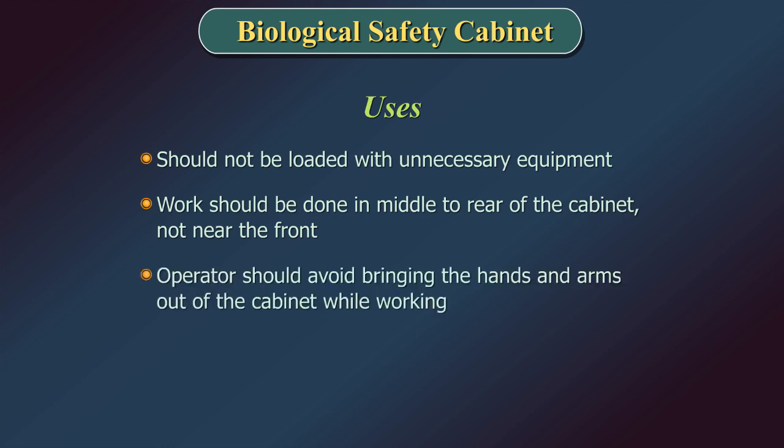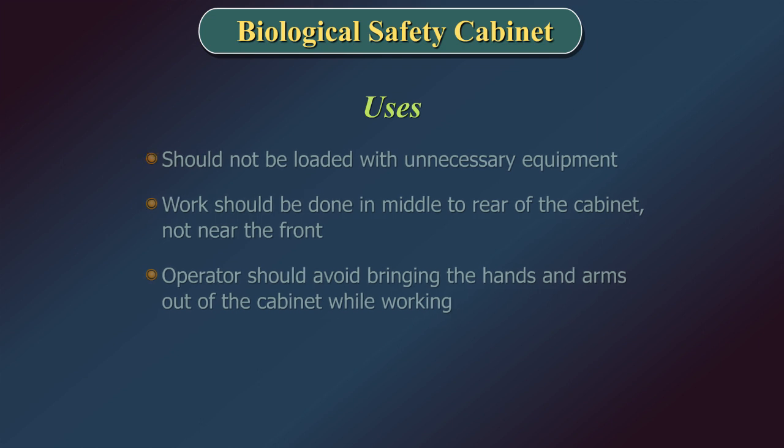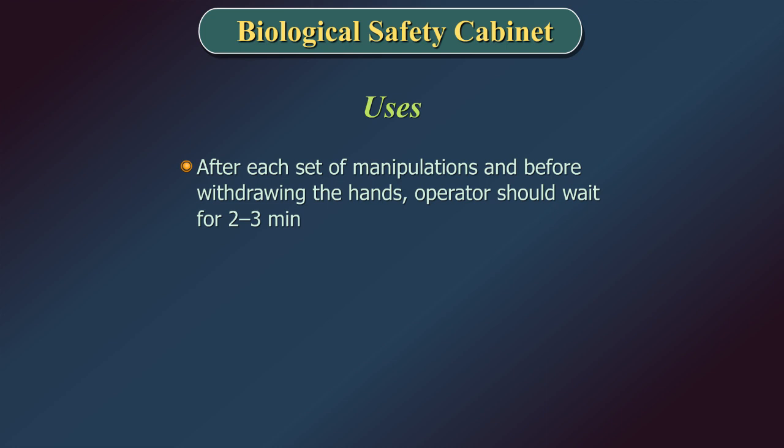The operator should avoid bringing the hands and arms out of the cabinet while working. After each set of manipulations and before withdrawing the hands, the operator should wait 2–3 minutes to allow any aerosols to be swept into the filters.